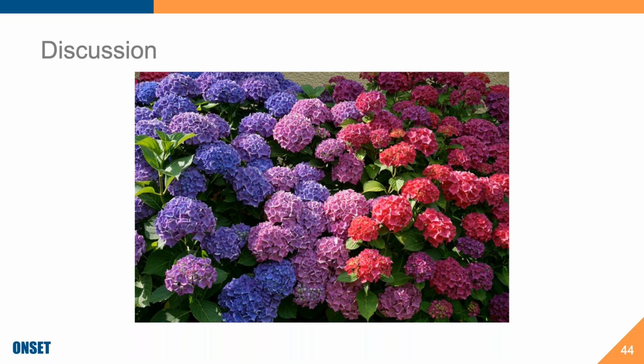Okay, let's see. If you've calibrated your probe at representative temp, but your in situ measurements are at a range of temperatures, and you know the temp when you take a pH reading, is there a formula for correcting? Yeah, ultimately in a situation like this, my best recommendation would be something that you probably don't want to hear, but that is to, instead of taking the pH values from your logger, actually take the potential values from your logger. And, I don't know, that doesn't answer your question, actually. That's a really interesting question.